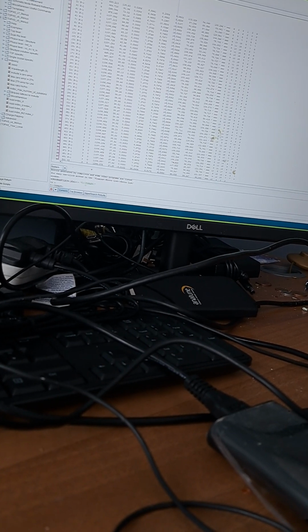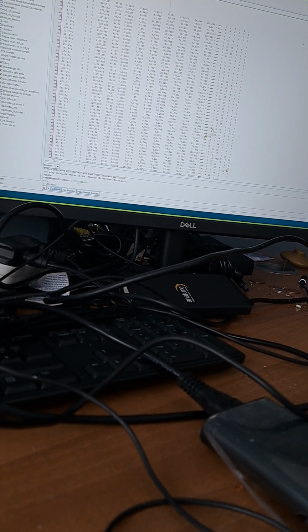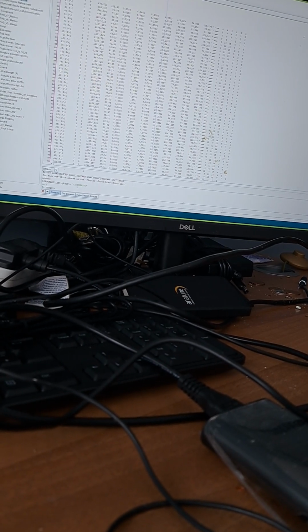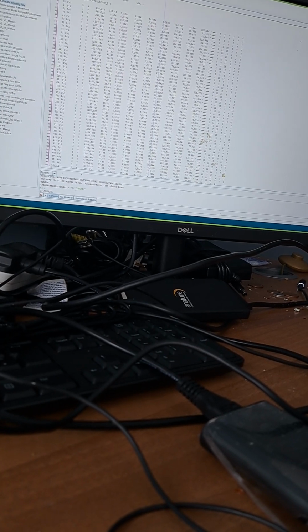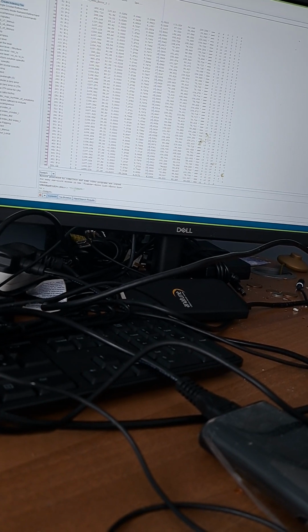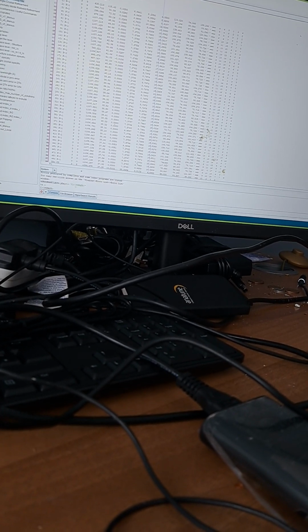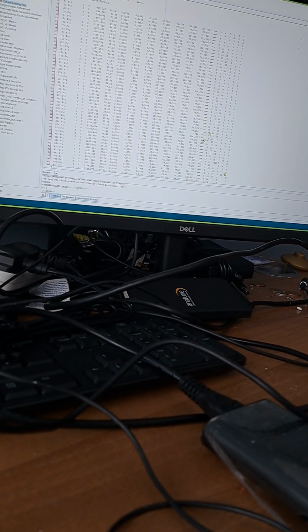Yes, I was trying to follow what you showed me and make my own file, and then I can go. It's just that indexing powder samples is really, really challenging. If you've got a good solution, it may be just that I've picked that one peak, or I might be one off here or one off here. Unless you've got really, really good data and it's really well characterized, it can be really challenging, even then.